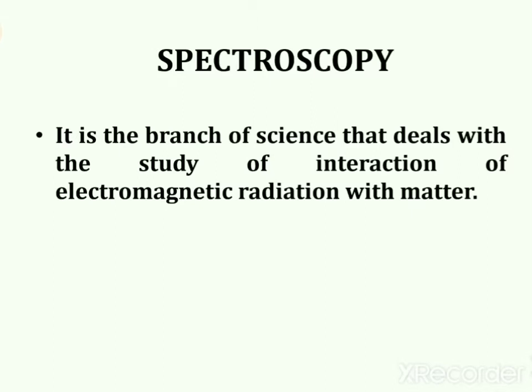So, in spectroscopy, we study the interaction of electromagnetic radiation, which is a form of energy, with the substance under investigation. When electromagnetic radiation of a certain type is incident upon any substance under investigation, it produces a specific spectrum. Spectrum study generates the base of spectroscopy.